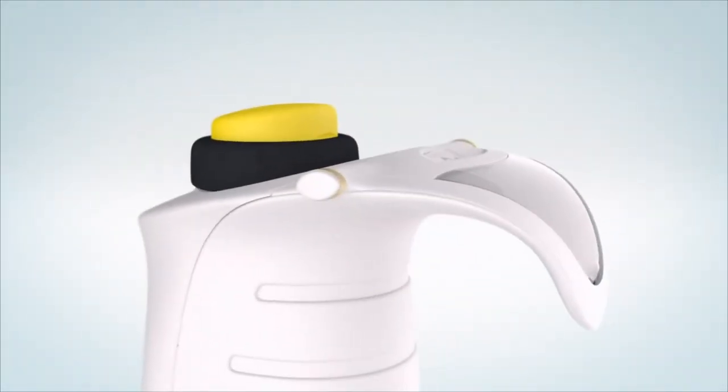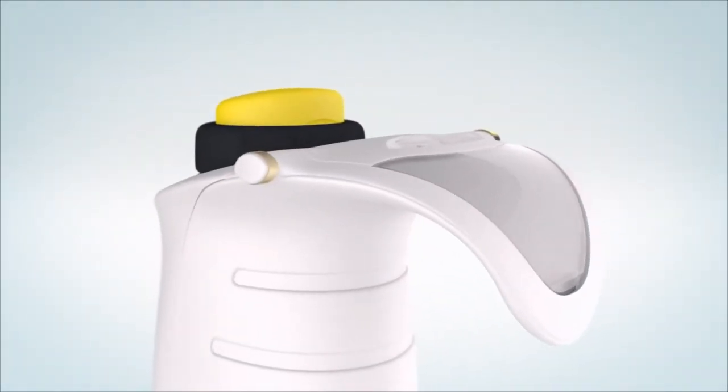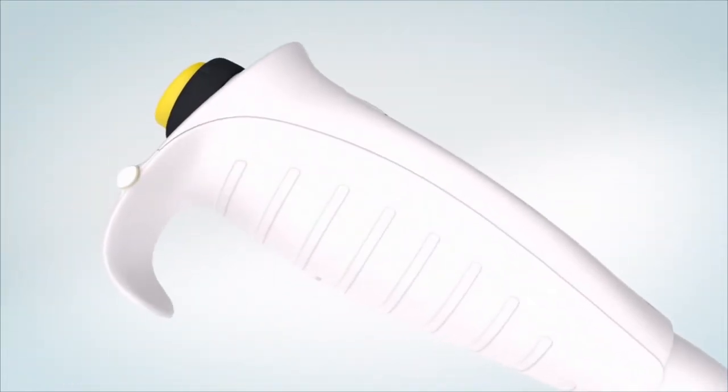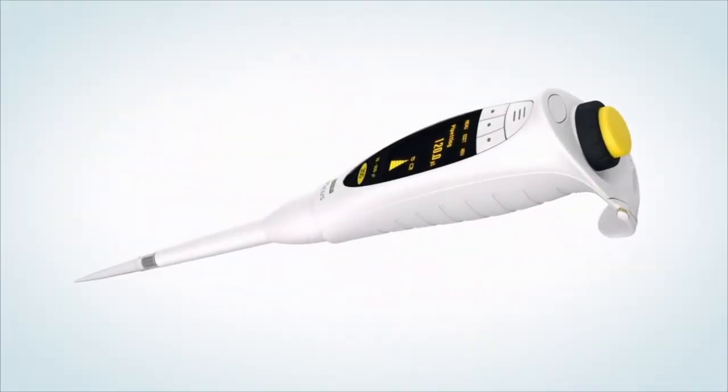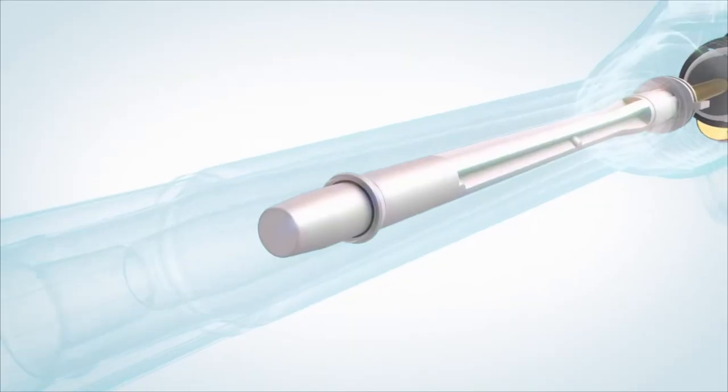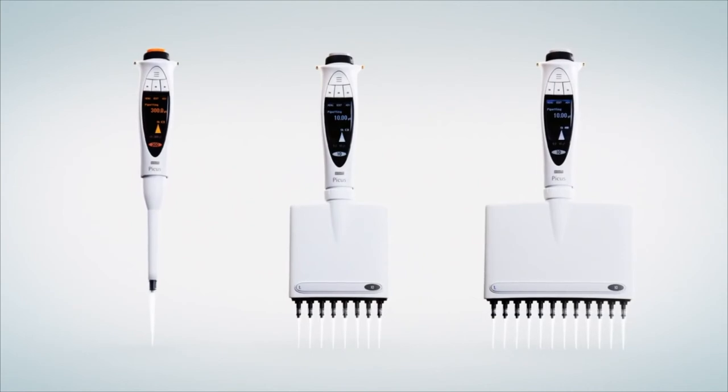We paid special attention to the ergonomic design of the pipette. PICUS fits the hand perfectly and lowers the risk of strain injuries. The new generation technology concept makes it possible to fit the greatest features in the smallest size. Revolutionize your pipetting. PICUS.